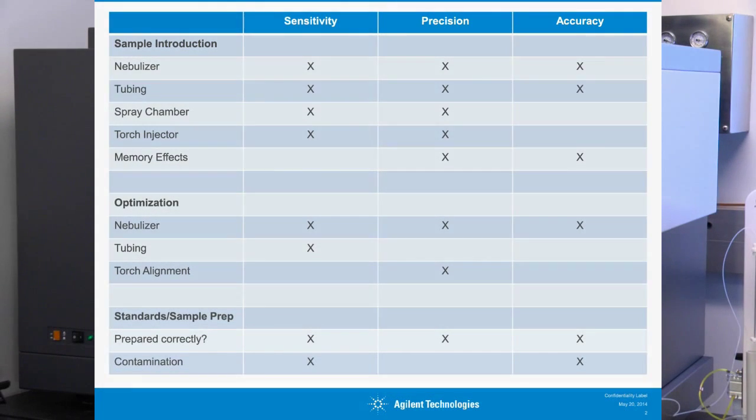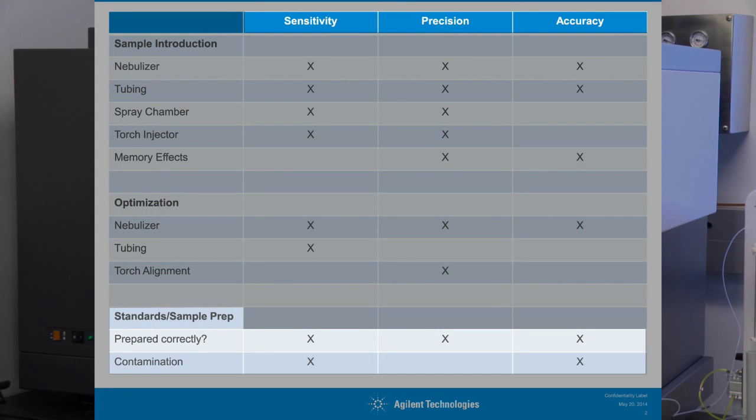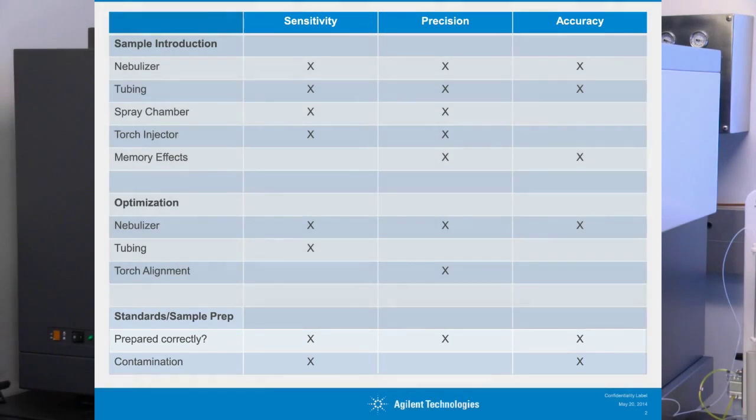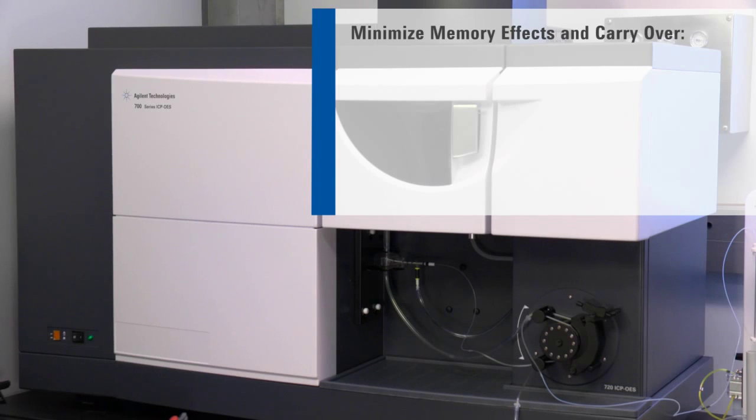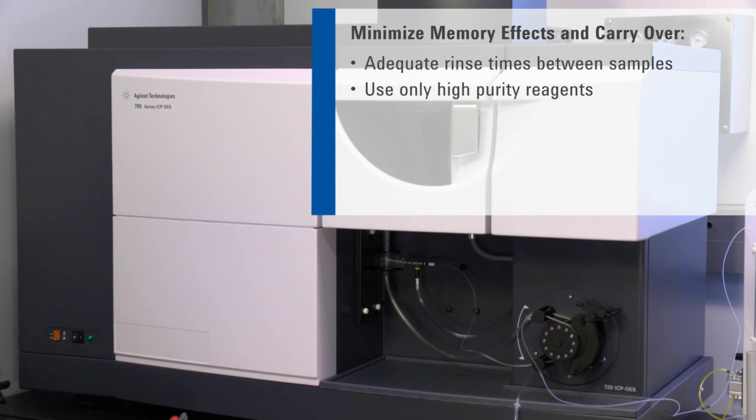The preparation of your calibration blank and standards, as well as your samples, is very important for achieving good sensitivity, accuracy, and precision. Look out for high readings for the calibration blank, which could indicate reagent contamination. Memory effects or carryover can be minimized by ensuring adequate rinse times. Use only deionized water and high purity acids, standards, internal standards, and ionization suppressants.